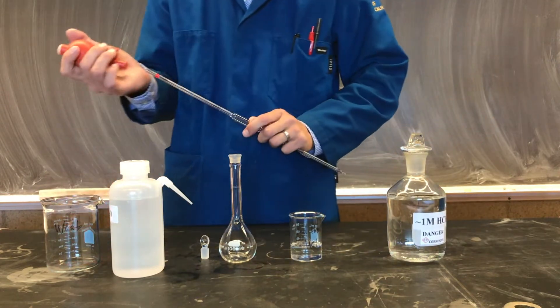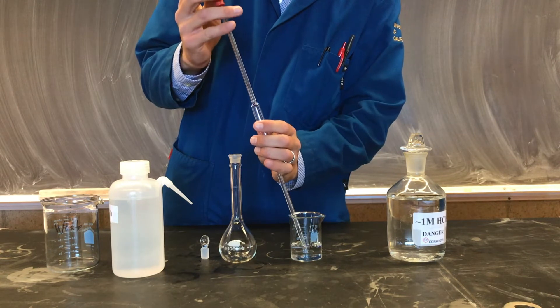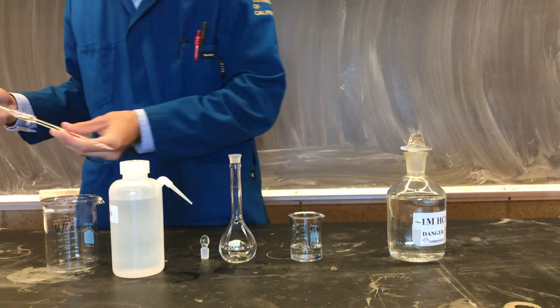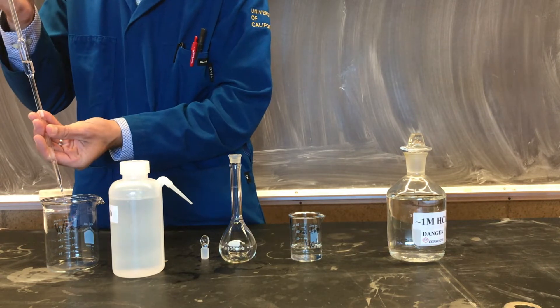The first step in making any such solution is to condition our volumetric pipette. This involves drawing up some solution using the bulb into the pipette and rinsing the inside of the glassware, which ensures constant concentration and removal of any impurities present.